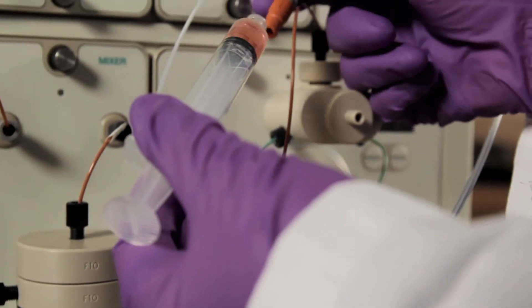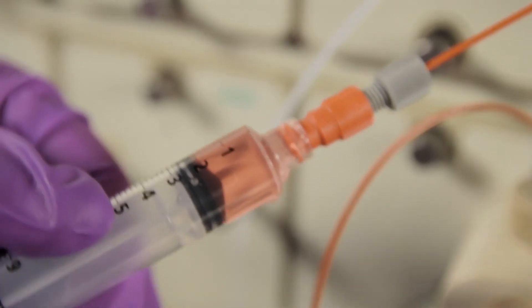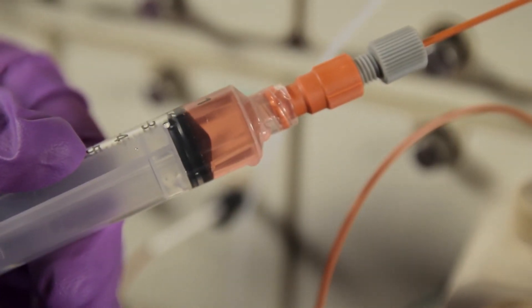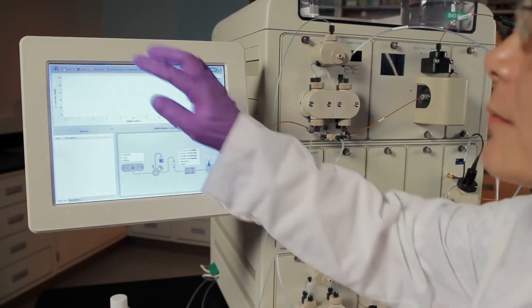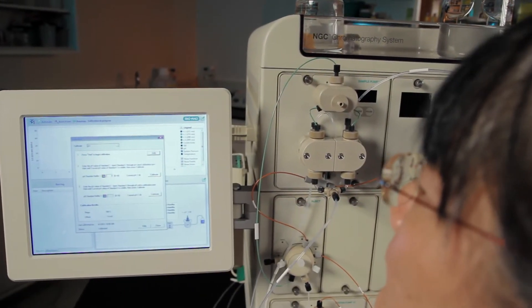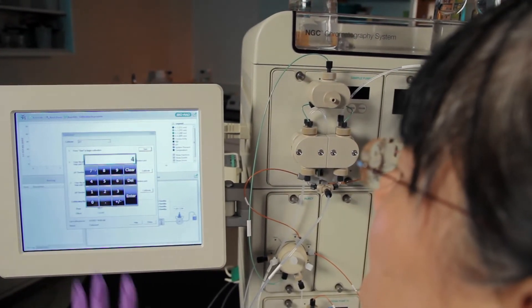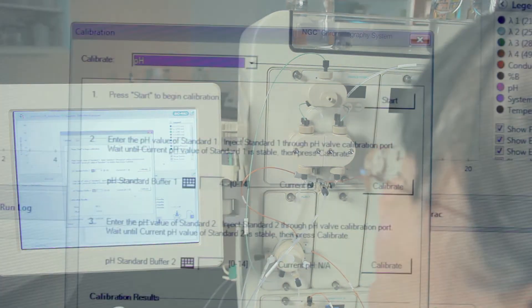Now, using a syringe with a luer fitting, inject 2 mLs of the first pH calibration solution into the CAL-IN port. Using the NGC touch screen, select Calibrate on the Chrome Lab drop-down menu. Select pH on the drop-down list and follow the steps in the pH calibration dialog box.